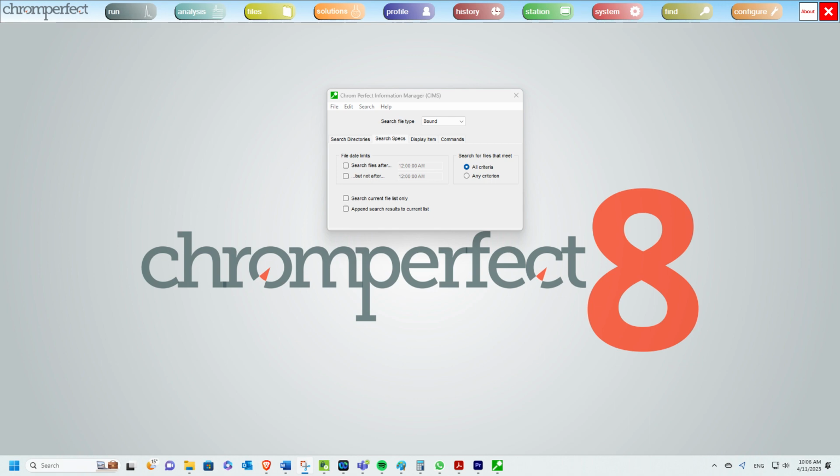Typically, they are used as follows. First, the user adjusts the criteria and appends the results until the list is quite large. Next, the user changes to searching the list, and applies other criteria that eliminate many of the candidates. By alternating between these 2 modes as necessary, the user may apply quite sophisticated logic and quickly locate the files of interest.